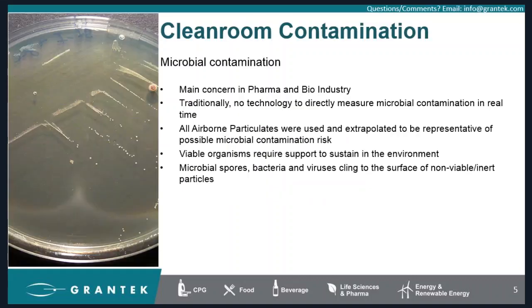So one of the key issues in clean rooms is microbial contamination. That's really the main concern in the pharma and bio industry. And traditionally, there has been no technology to directly measure microbial contamination in real time. So what happened was that all airborne particulates were used and extrapolated to be a representative of possible microbial contamination risk. Those viable organisms require support to sustain in the environment, and microbial spores, bacteria, and viruses cling to the surface of non-viable or inert particles.